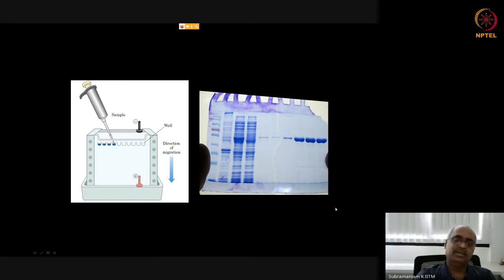In this experiment, what I have done is I have checked whether my cloned protein, the genetically engineered one, is being produced. And if it is being produced, am I able to purify it out? And in which fraction has the pure protein come? And you can see here the 1st, 2nd, 3rd, 4th, 5th, 6th fractions contain my protein, in binding to the column, washing and eluting that I described yesterday with respect to affinity chromatography.